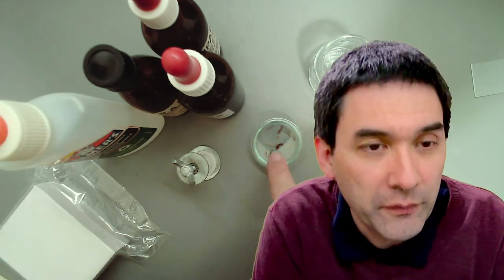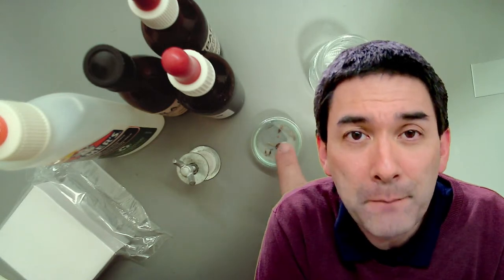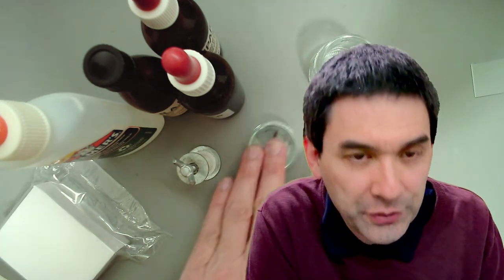And I've got a few of them here, and I've got also some bee parts, a few bee wings and bee legs here. Before I start mounting them, and before I talk a little bit about making slides, I would like to give you a little bit of context from where I got them. It was several months ago. Maybe you already know that in my non-online life I'm a high school biology teacher.